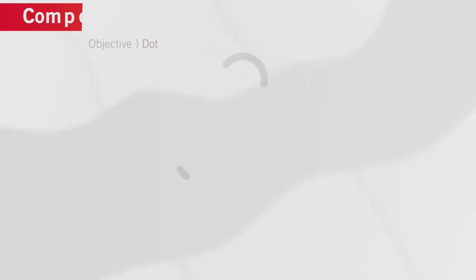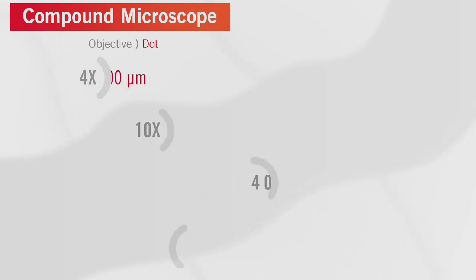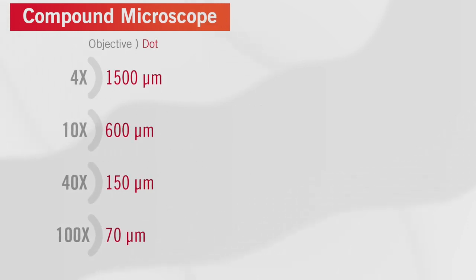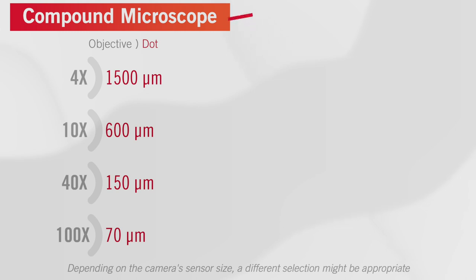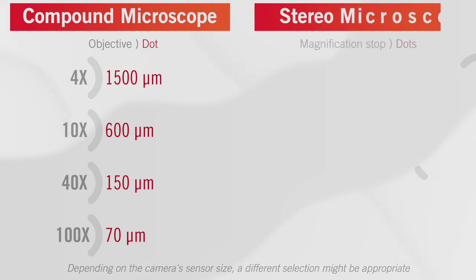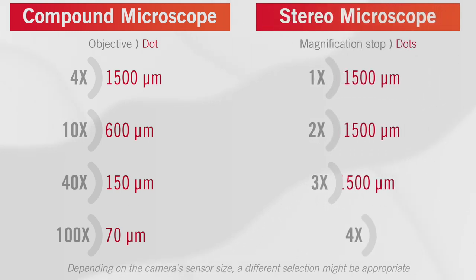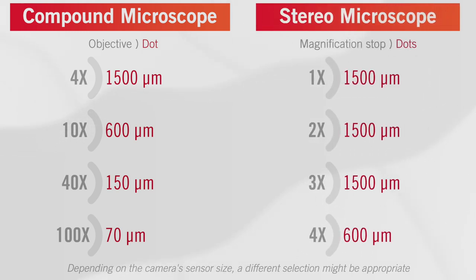As the respective dot must be pictured in maximum picture section for best possible calibration, we suggest the following objective dot combination. For every objective of your microscope, or for each magnification stop of your zoom stereo microscope, it is necessary to do a separate calibration.